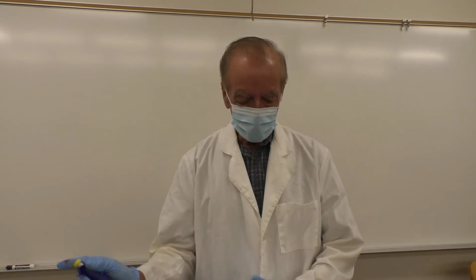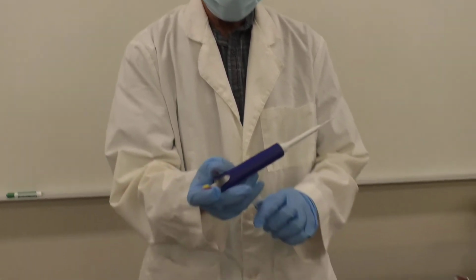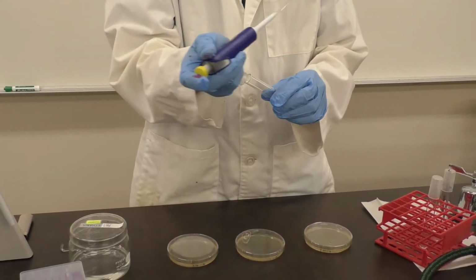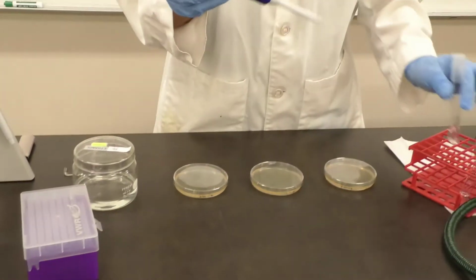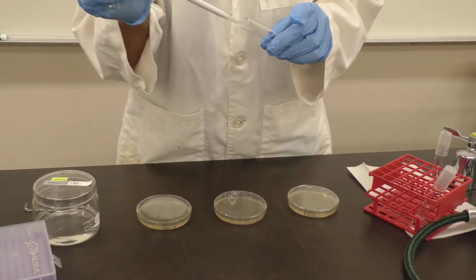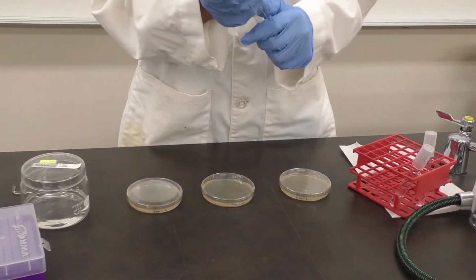If you start with the most dilute of your dilutions, you can work your way back and not change the tip on your pipette. So I'm spread plating 100 microliters from each dilution. 100 microliters from each. Cap to the tube. Hold the top over, 100 microliters. Second dilution. Cap to the tube, not tube to the cap. 100 microliters. And the third dilution.